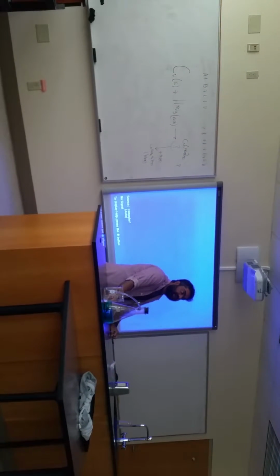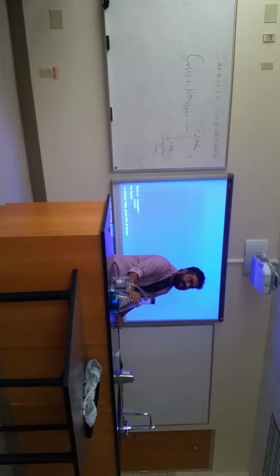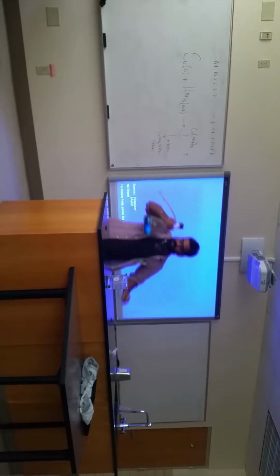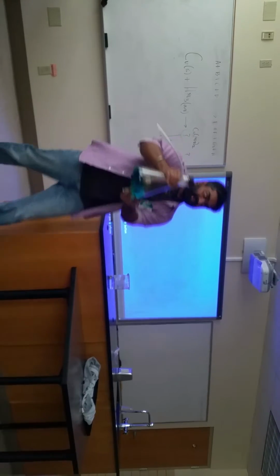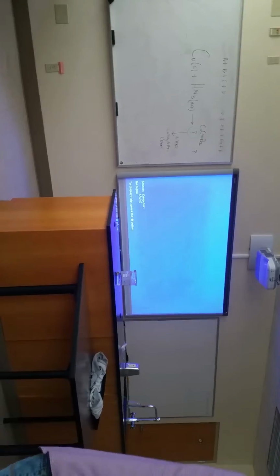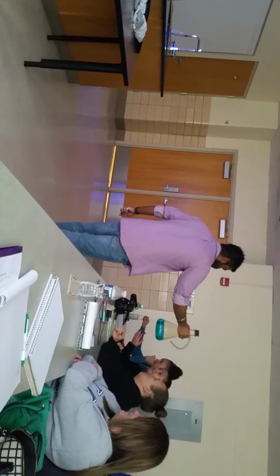we still have a ton of nitric acid. So if I keep adding more and more copper into it, but then I gotta wear goggles because at one point, this flask can't hold any heat. If any of you wanna hold this thing, you would just see how heavy this thing is. Just for the front row people, back row people can come and hold it.